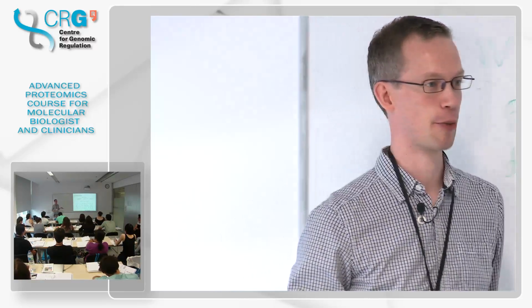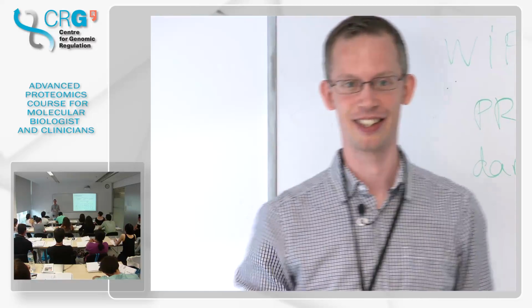And how well it works, that's another question, right? So at least you should know that this is the problem it tries to solve. Sometimes it works, and sometimes it probably fails at this, because these things are a bit difficult. But this is the limitation of shotgun proteomics, that we cut things into pieces, and then afterwards try to put it together.